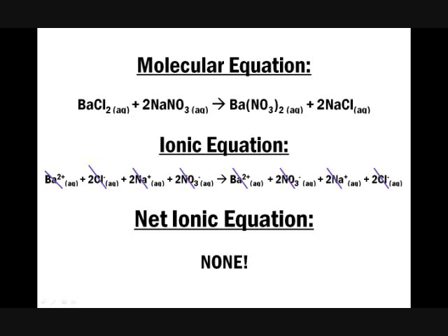In this reaction, no precipitate formed because the solution was unsaturated. The solution hasn't reached the total amount of substance that can be mixed in the solution. Due to this, no precipitate exists and therefore no equilibrium.